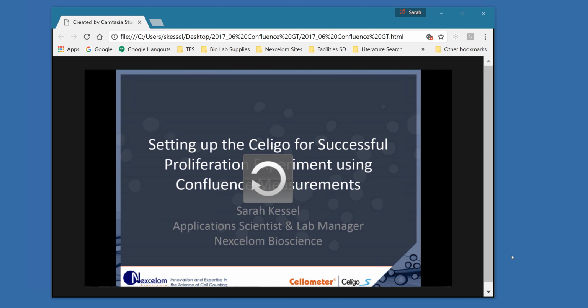Alrighty. We do have another question that came through. Is there more accuracy with a certain algorithm over others? Is bright field better than texture, or is it based on cell density?